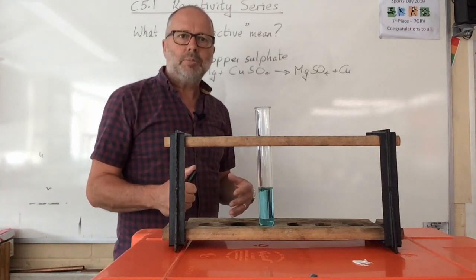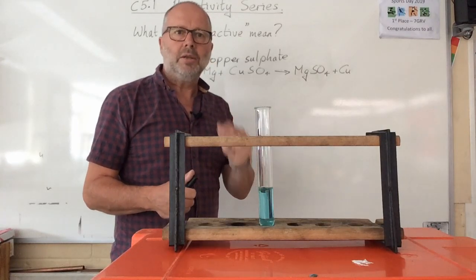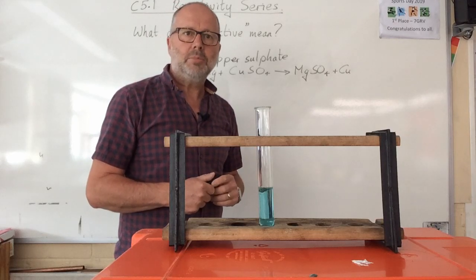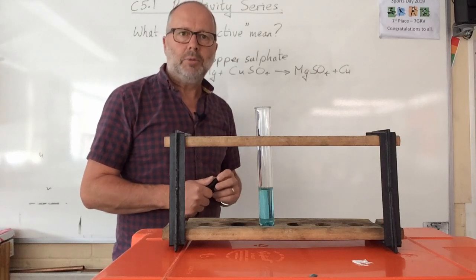Now I'm going to do another little experiment with 3 little metal compounds and 3 metals and see who can displace which from whom. Okay, so I shall pause this, and when we come back we'll be doing an experiment.